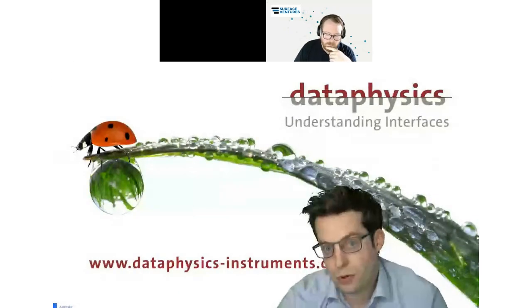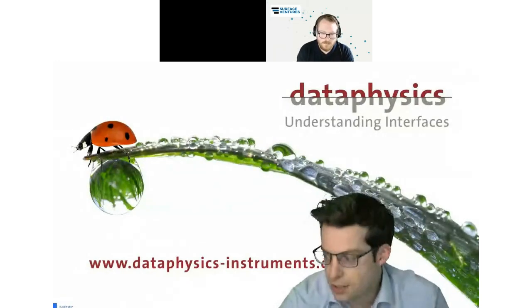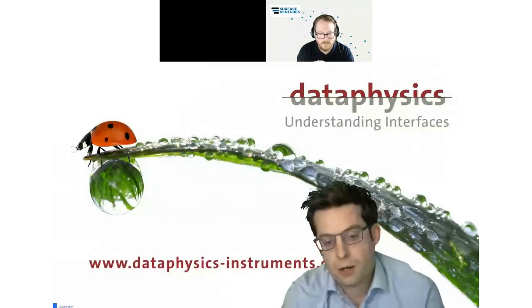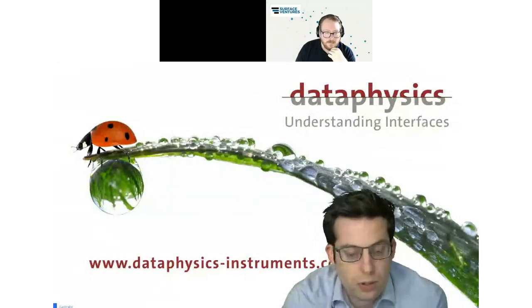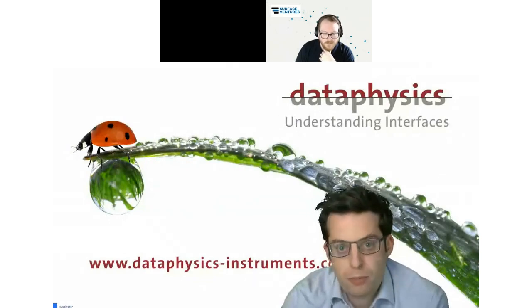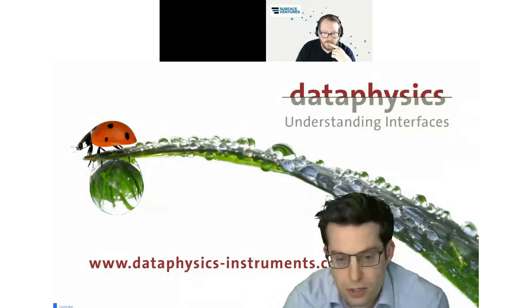What I can tell you is, if you use an optical device in order to measure contact angles, then the method gets more and more inaccurate the bigger the contact angle is. There is a very nice publication, I think from Professor Ras, maybe we can share this later on. He shows the errors that you make when measuring contact angles optically. If you are talking about a 170 degree contact angle, then already from the picture quality, the error range is probably around 2 to 3 degrees. Below 120 degrees, the measurement error is much less than 1 degree. If you are even lower, it's very, very precise.